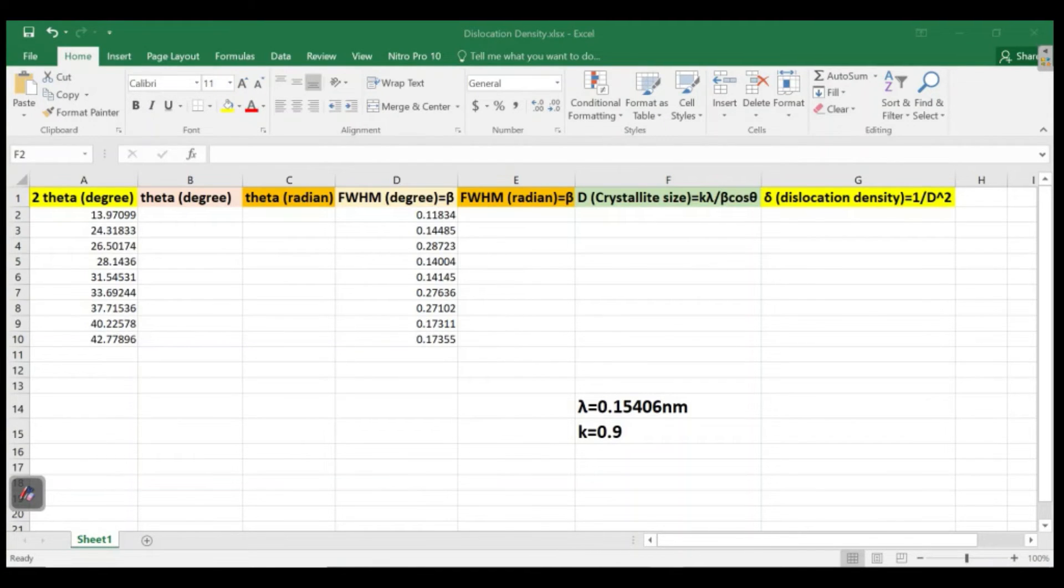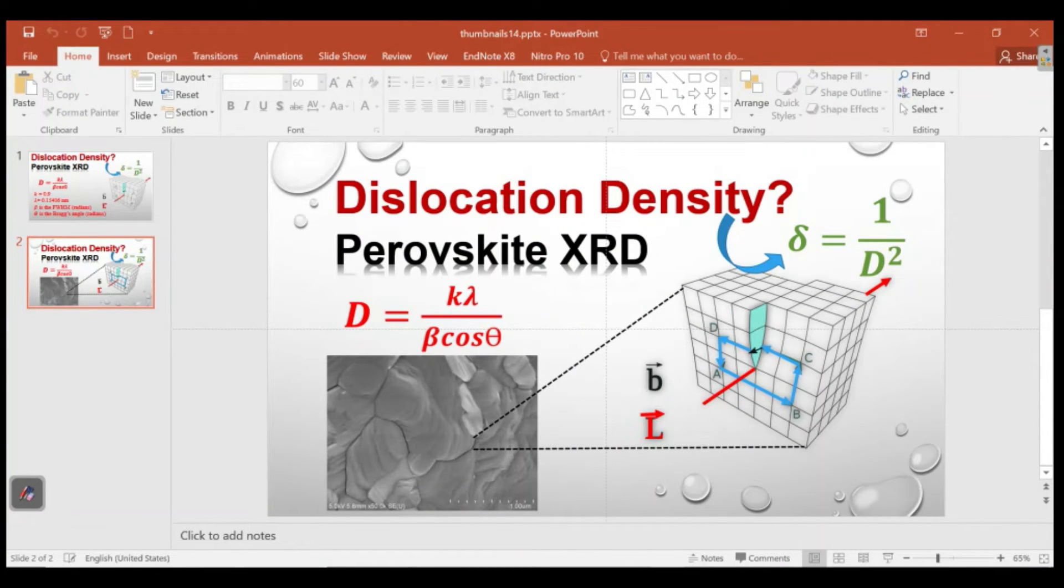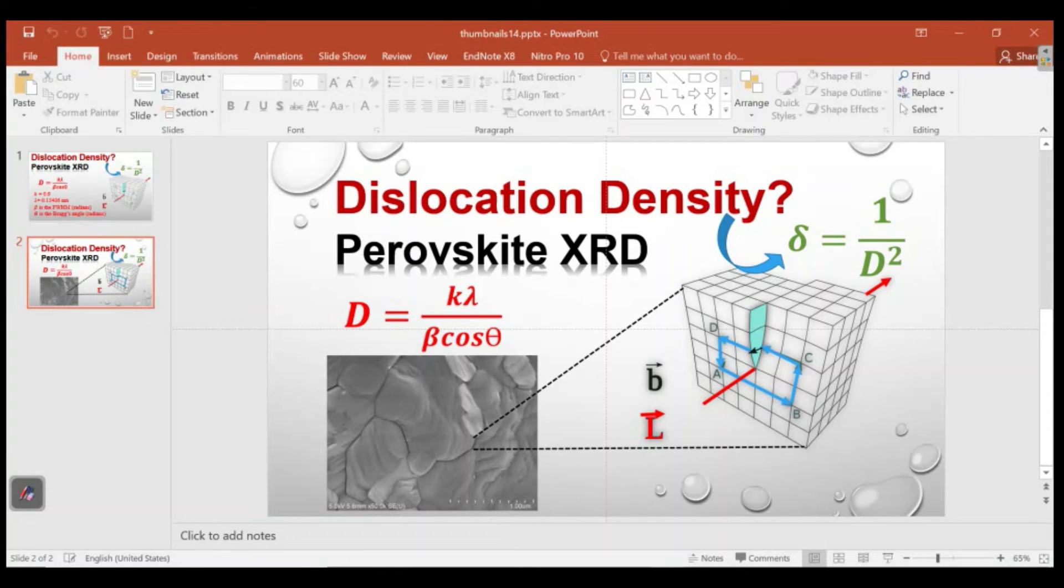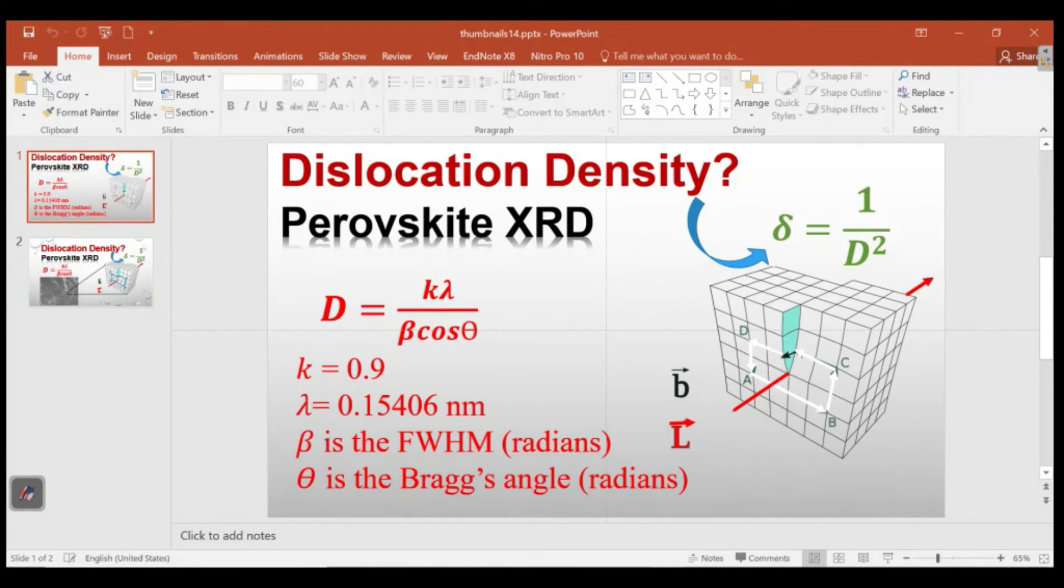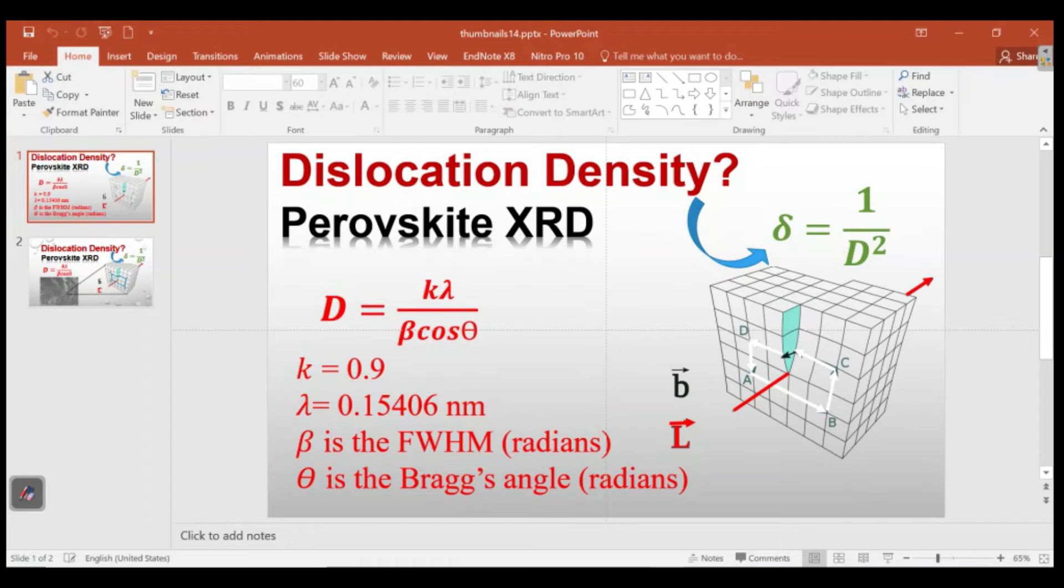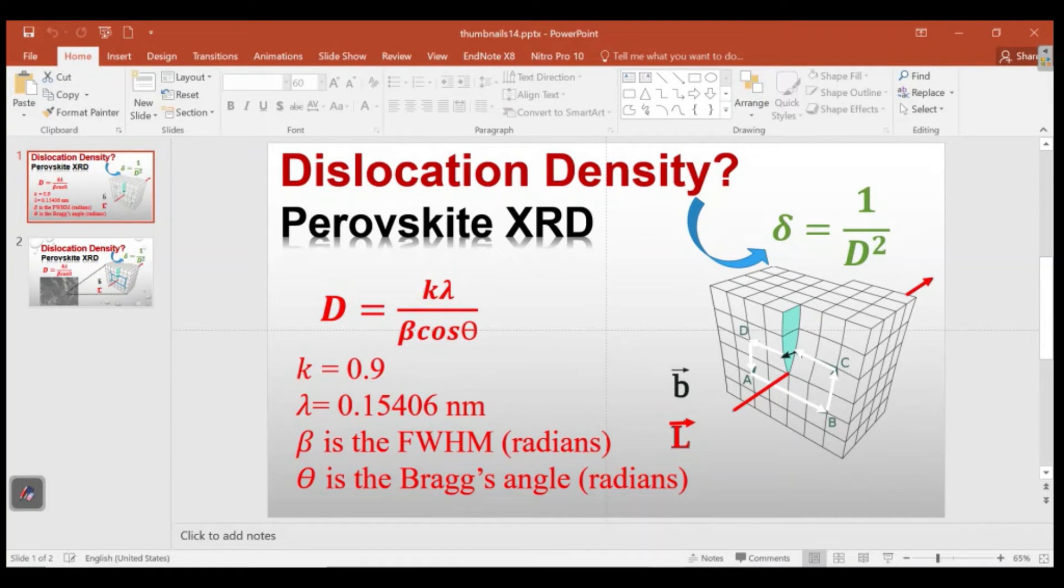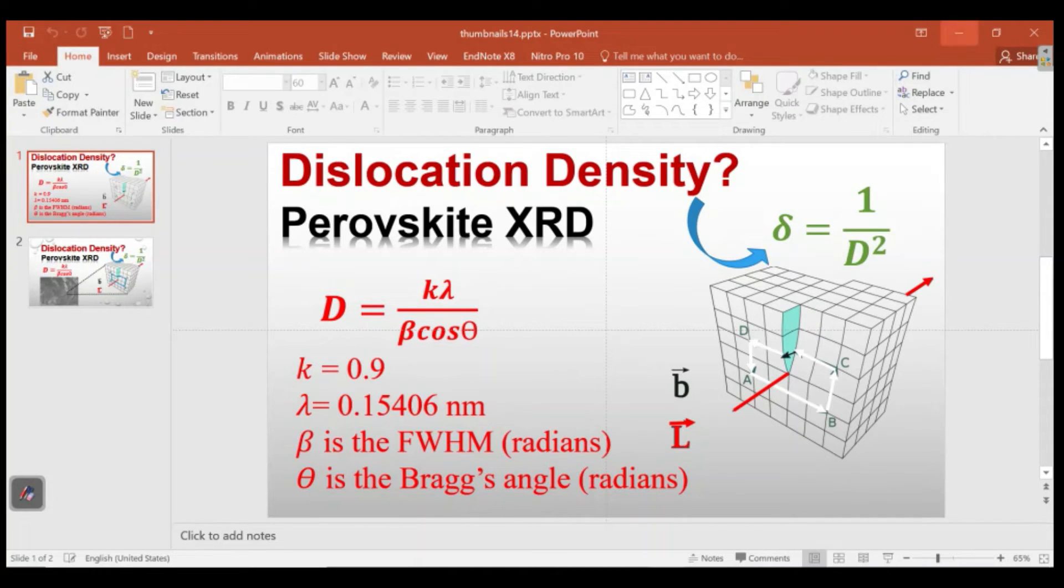D is actually the crystallite size: k lambda divided by beta cos theta. As we have seen in the Scherrer equation, k is actually the Scherrer constant which generally varies from different values, but for the sake of example I am just taking it 0.9. Lambda is actually the x-ray source wavelength in angstroms, and I have taken it in nanometers 0.15406. Beta is actually the FWHM and that should be in radians in this case. Theta is the Bragg angle and that should also be in radians.